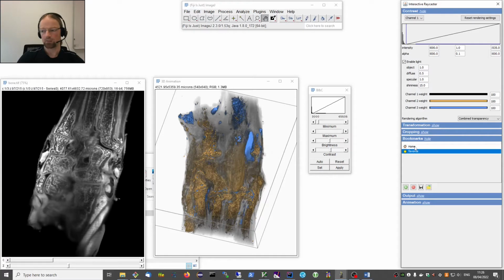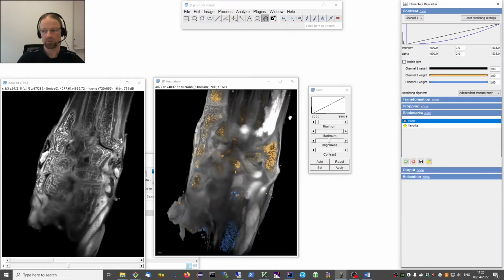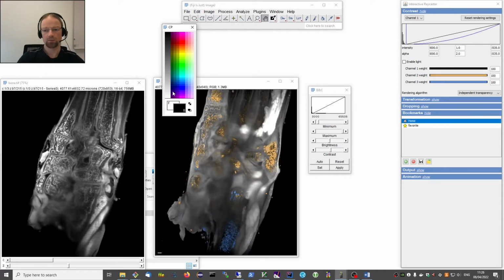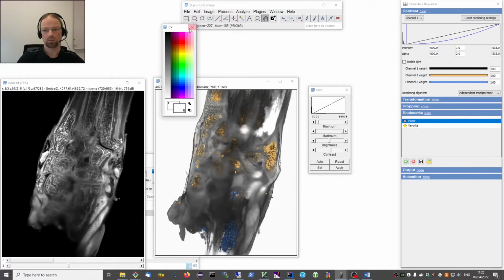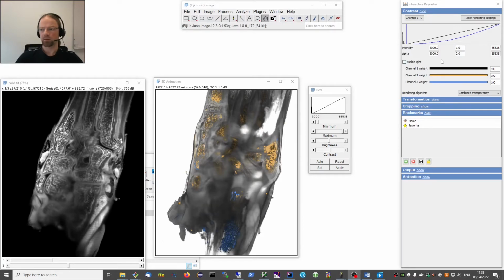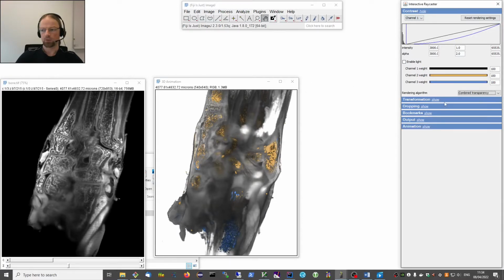Okay, for now I think I go back to my initial state. Still I would change the background to white again. And we'll use that. So this is it basically about the contrast panel, and let's now quickly look at the other panels that we have here.